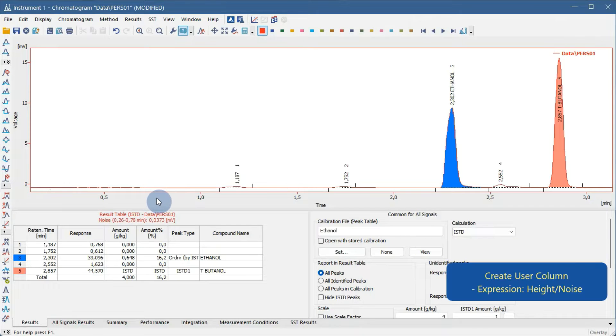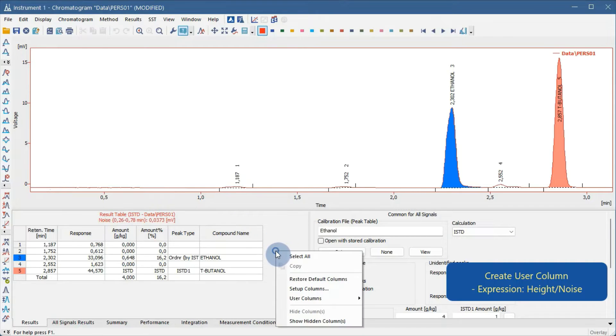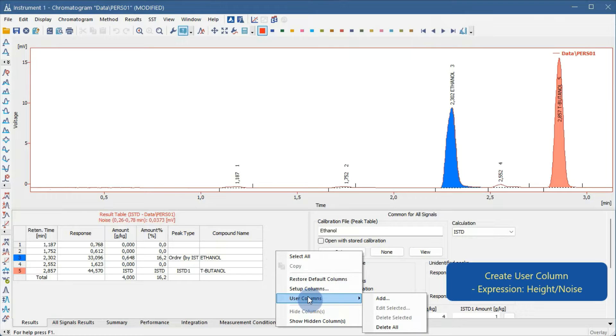Right-click the result table to invoke the local menu, and open the Setup Columns dialog.